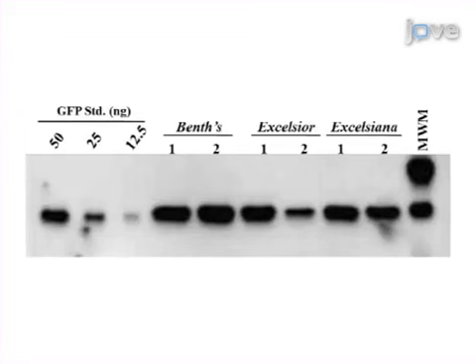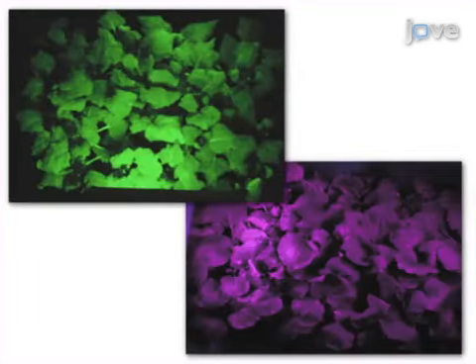Ultimately, immunoblotting and fluorescence assays are used to show recombinant protein production in the infiltrated plants. The main advantage of this technique over existing methods like manual infiltration is that the vacuum infiltration method can be scaled up for industrial production of recombinant proteins, including vaccines and therapeutic proteins.